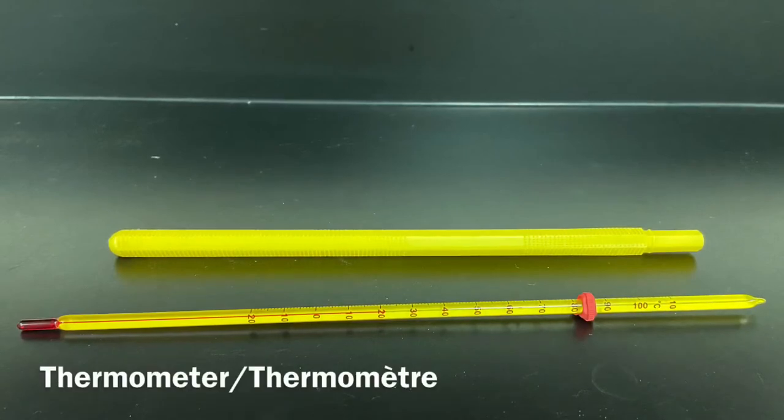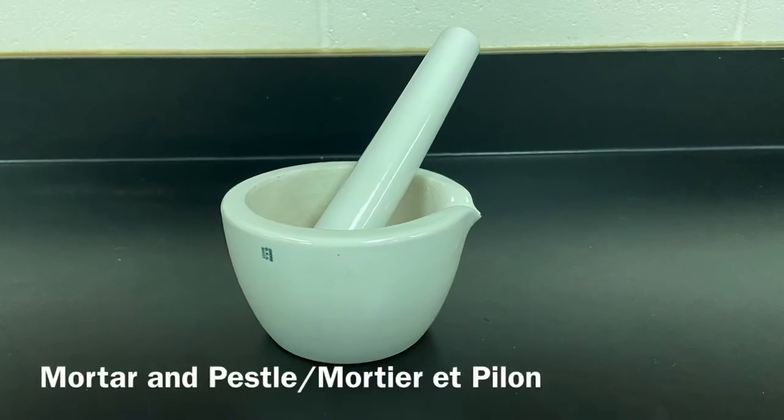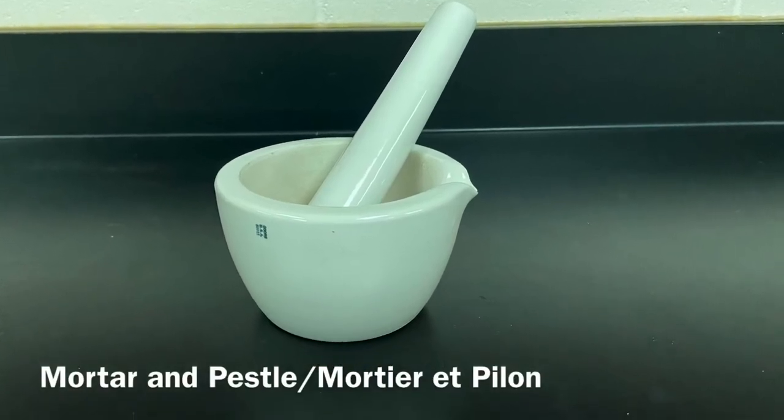Thermometer. Thermomètre. Mortar and pestle. Mortier et pilon.